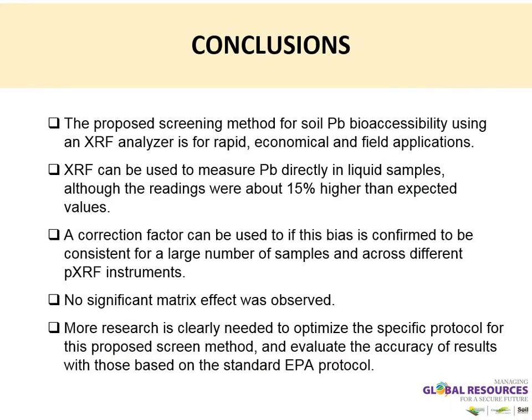So the proposed screening method with the glycine solution can be used with XRF analyzer for rapid, economical, and field applications. So anyone can use it, either you're a gardener or just a scientist who works in the field. You just need to have an XRF. And XRF can be used to measure lead directly in liquid samples, although the readings may be 15% off and higher than expected values.